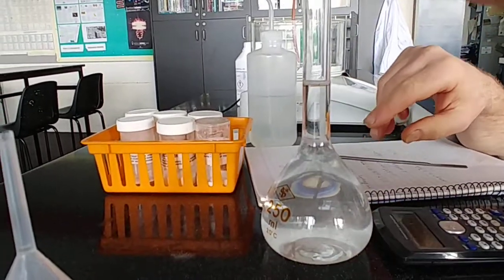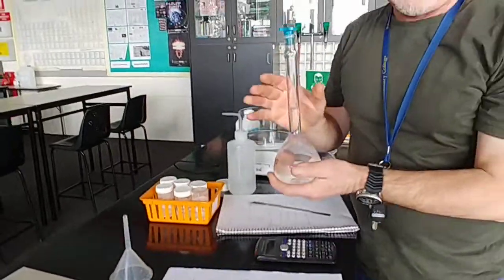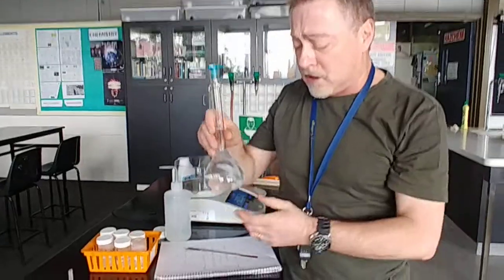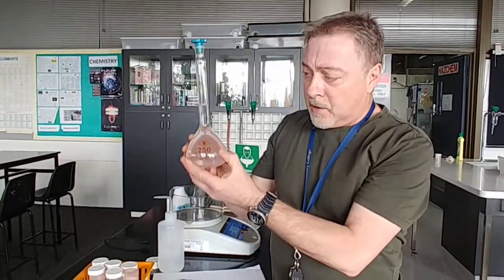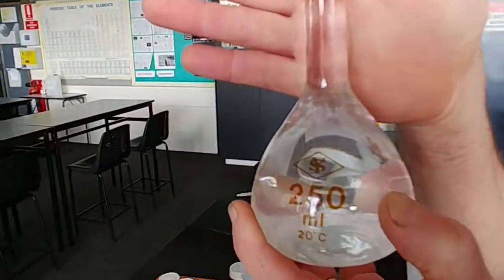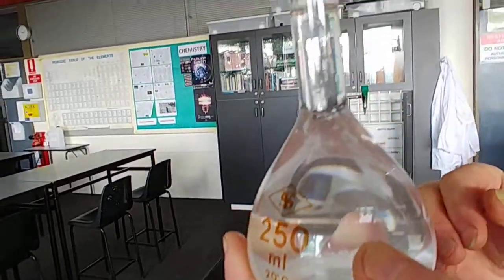But that is how you prepare a standard solution. You can go one step further and titrate this against another standard solution. You can work out all your errors and all that sort of stuff. But for the purpose of us today, that is pretty much how you prepare a standard solution. You can see those bubbles there. They're still coming up and the level's actually dropping. There's a lot of air bubbles in there still.